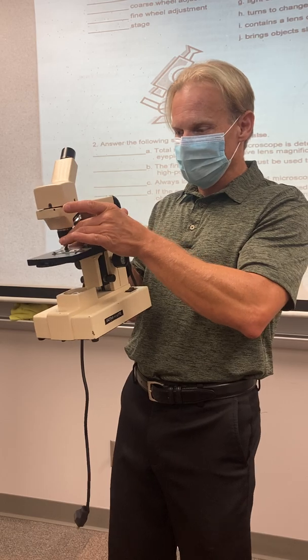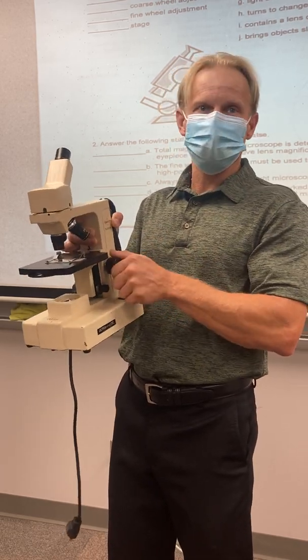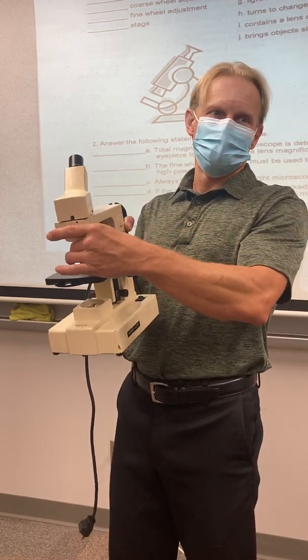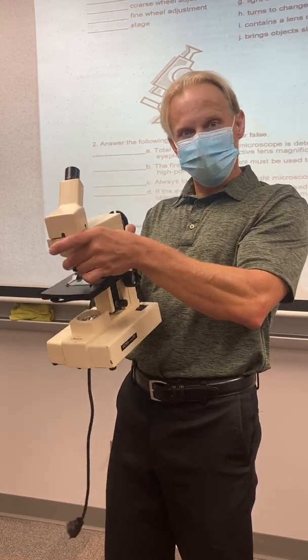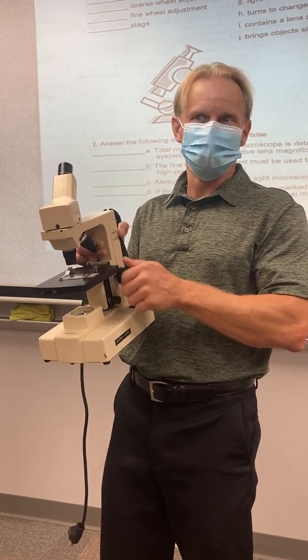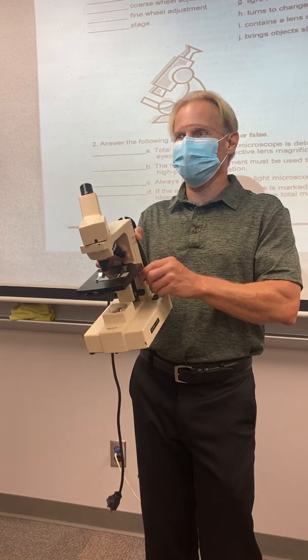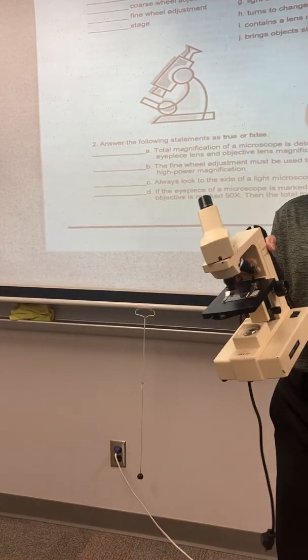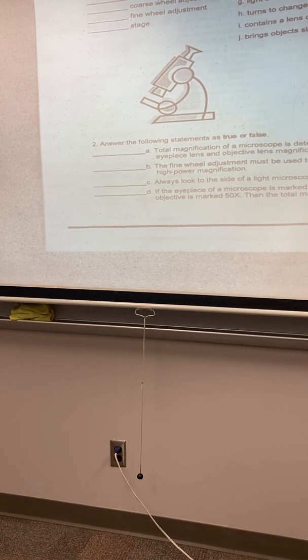Okay? If you screw this up, if you get this to high power and it's not right and you can't find it and you call me over, the first thing I'm going to do is back it up to low power and start over. So if you have trouble on another power, back it up. Go back to low power, bring the stage up and start over. Okay? I mean, I have to do that almost every time. If you can't find it and it's all mixed up, I'm starting back at the beginning. You don't just go to high power and then luck out. I mean, sometimes you can, but not super often.